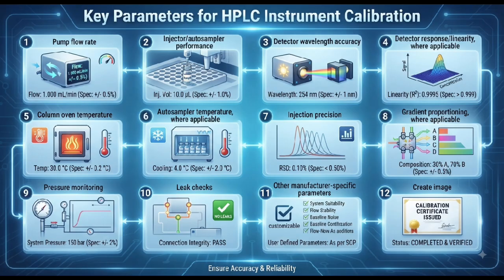Important HPLC parameters. Now let's discuss the major HPLC parameters that may be evaluated during calibration. The exact parameters depend on the HPLC model, detector type, laboratory procedure, manufacturer recommendations, and applicable regulatory requirements.